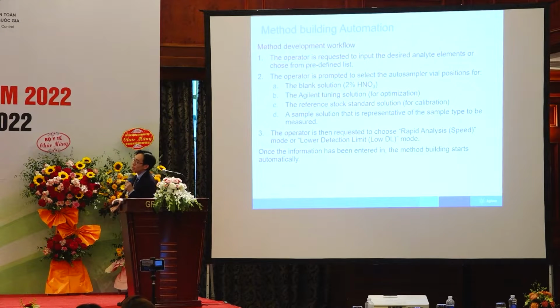What this application note describes is how we have something in the software that allows an inexperienced user to easily build up a method on ICPMS and start analyzing immediately. The user just has to follow the workflow that is set up in the software.